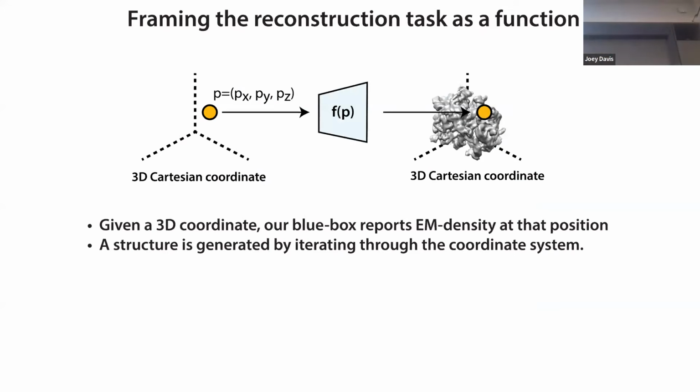The way that we started thinking about it was, well, instead of using the data to try to infer the voxel array directly, let's think about using the data to just learn a mapping function. So this will actually probably come more naturally for this audience than most times I give this talk. But it's a little bit counterintuitive. Instead of learning this, I'm going to learn a mapping function parameterized by some 3-space Cartesian coordinate, and its job is to take that as an input and output the density in 3 states.